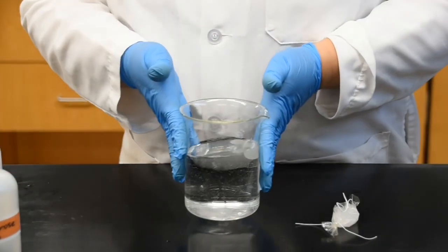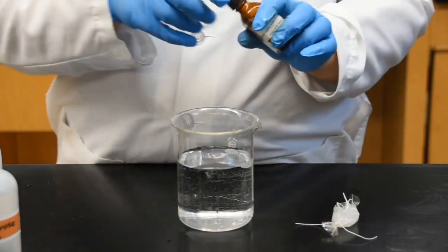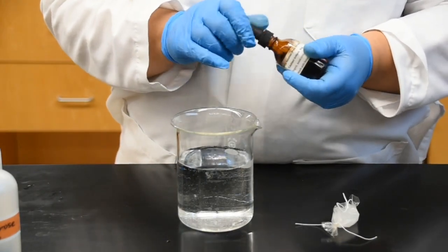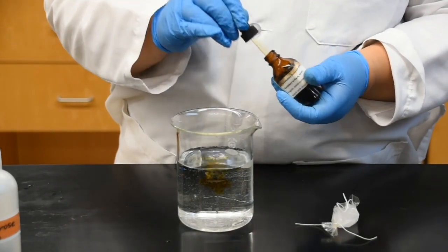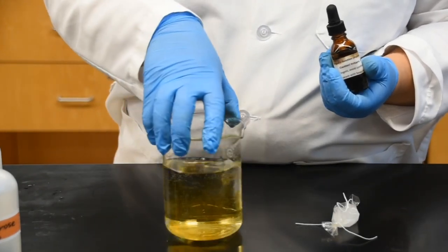So inside this beaker, what I'm going to add is a few drops of Lugol iodine. Now Lugol iodine is an indicator for starch. So again, if you look at the normal color, I can show you when I add it to the water. If I add a few drops of Lugol iodine, you can see the color is yellow, right? So it's changing our water to yellow.